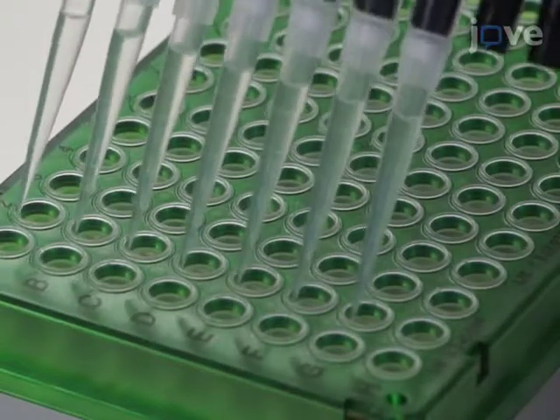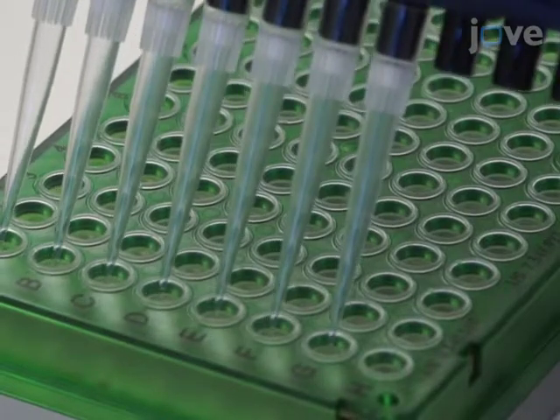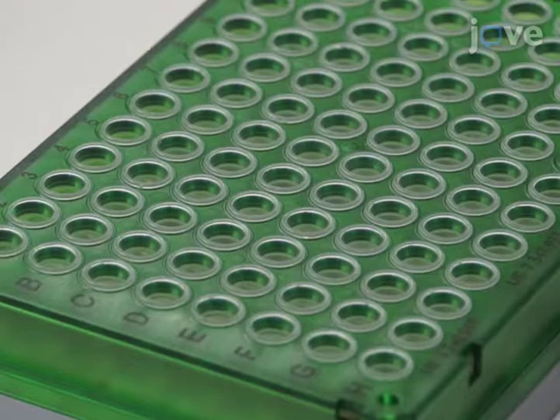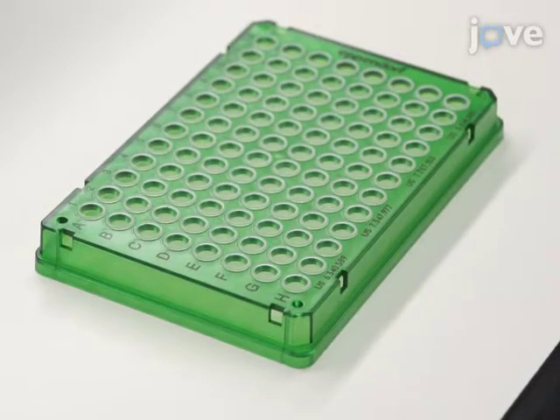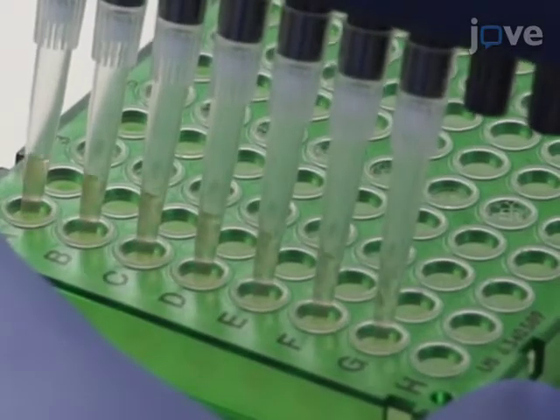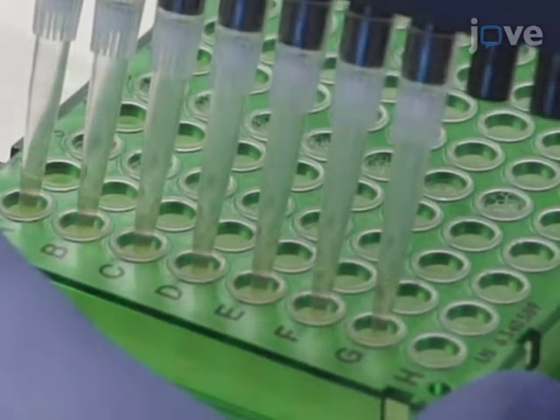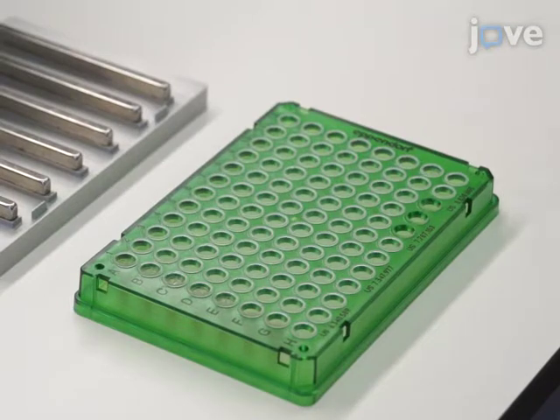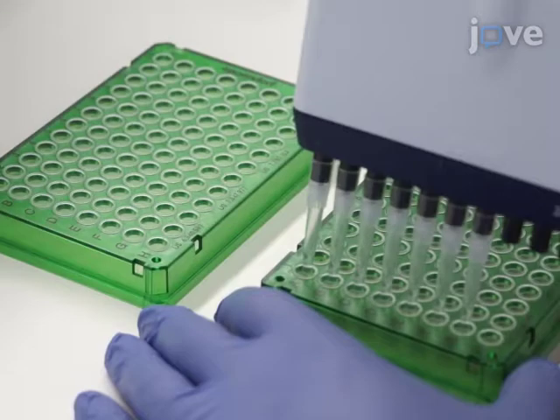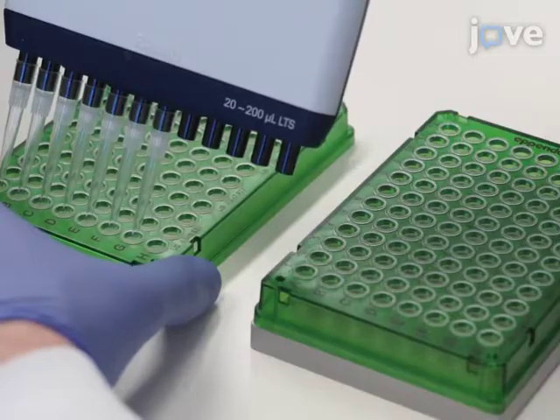After discarding the supernatant, add 150 microliters of 70% ethanol to the samples and incubate at room temperature for 30 seconds without disturbing the beads. After allowing the beads to dry, remove the samples from the magnet and add 30 microliters of 10 mmol Tris-Cl. Mix by pipetting 25 times. After incubating the samples at room temperature, place them back on the magnet and incubate at room temperature for another 4 minutes. Transfer 20 microliters of each sample to a new 96-well plate for library preparation.